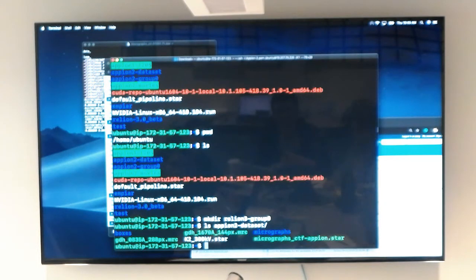Again, how large should your box be? As a rule of thumb, 1.5 to 2 times larger than your particle of interest. That can be confusing if your particle is not a sphere but an oblong shape. But the idea is that even if it's oblong, the box size is large enough that if you don't center your particle correctly, there's enough room to move it around. And note that you might only see the center of it. There actually might be additional features beyond even what you think you see.